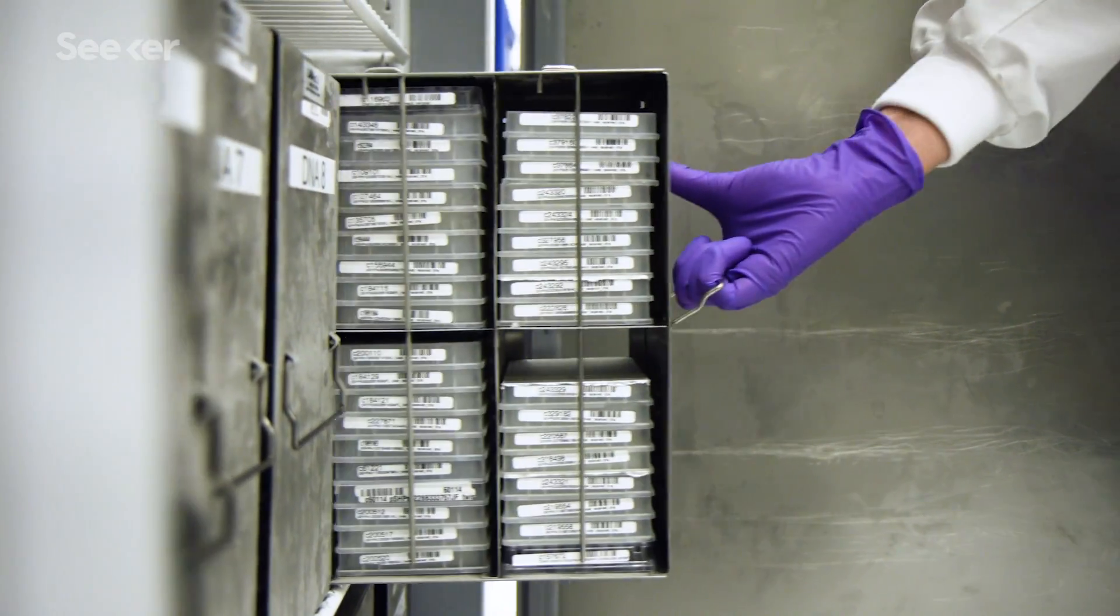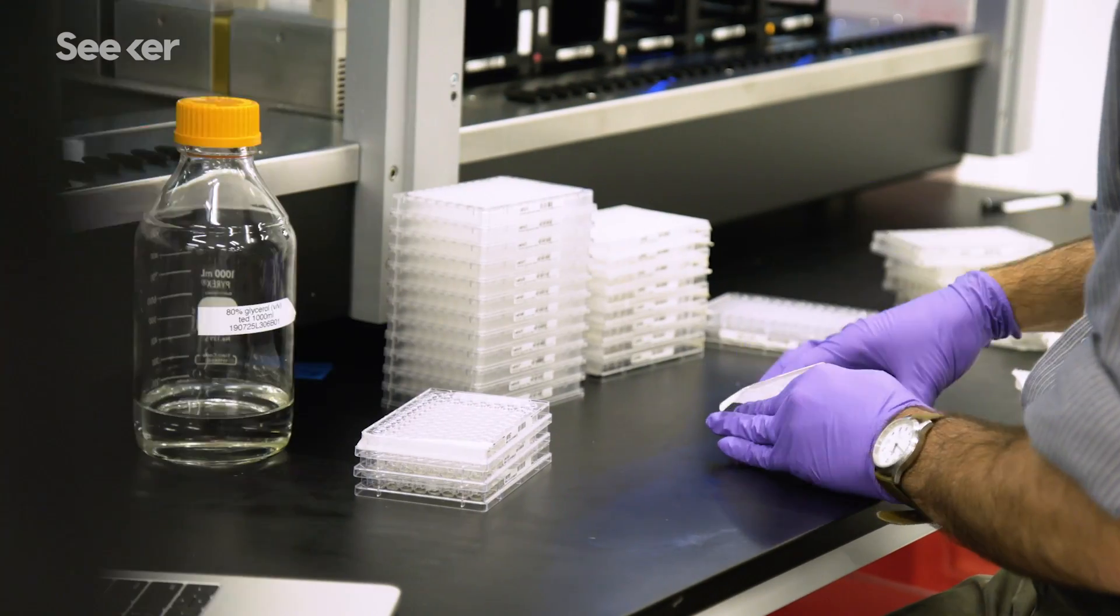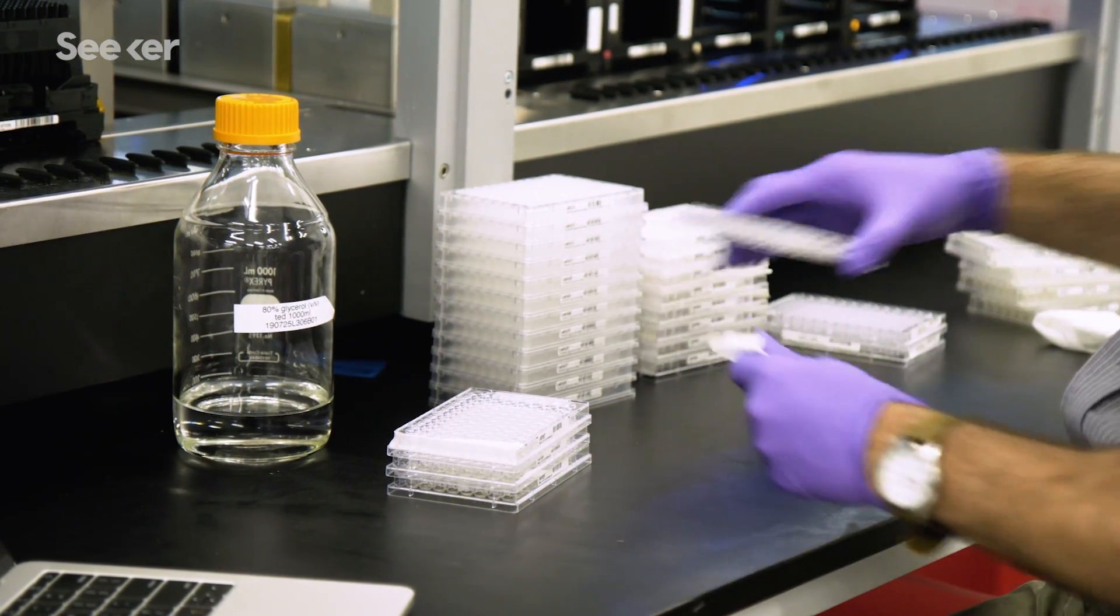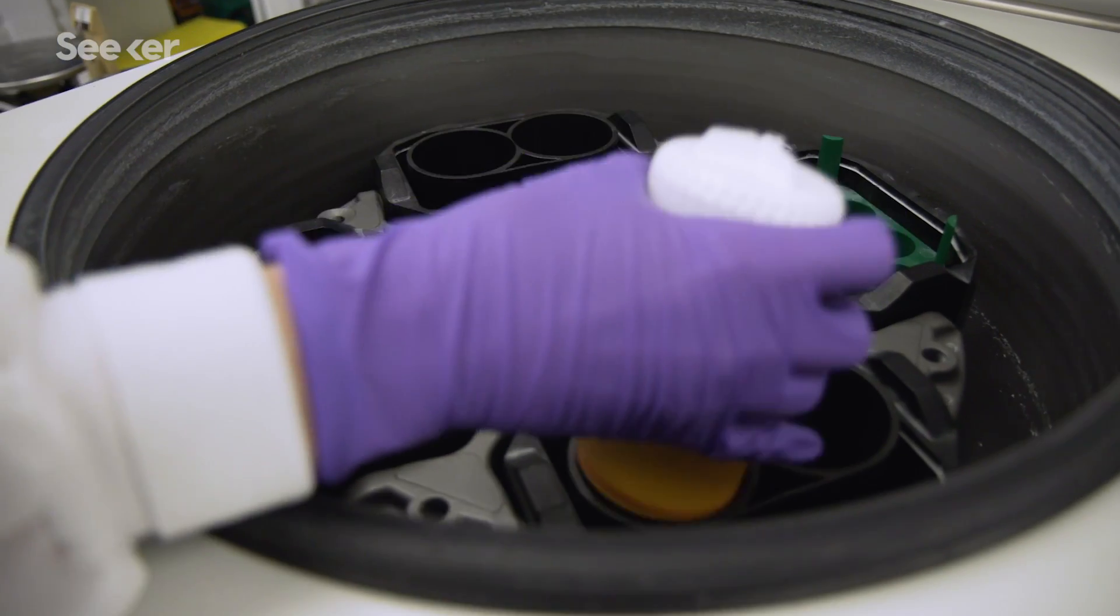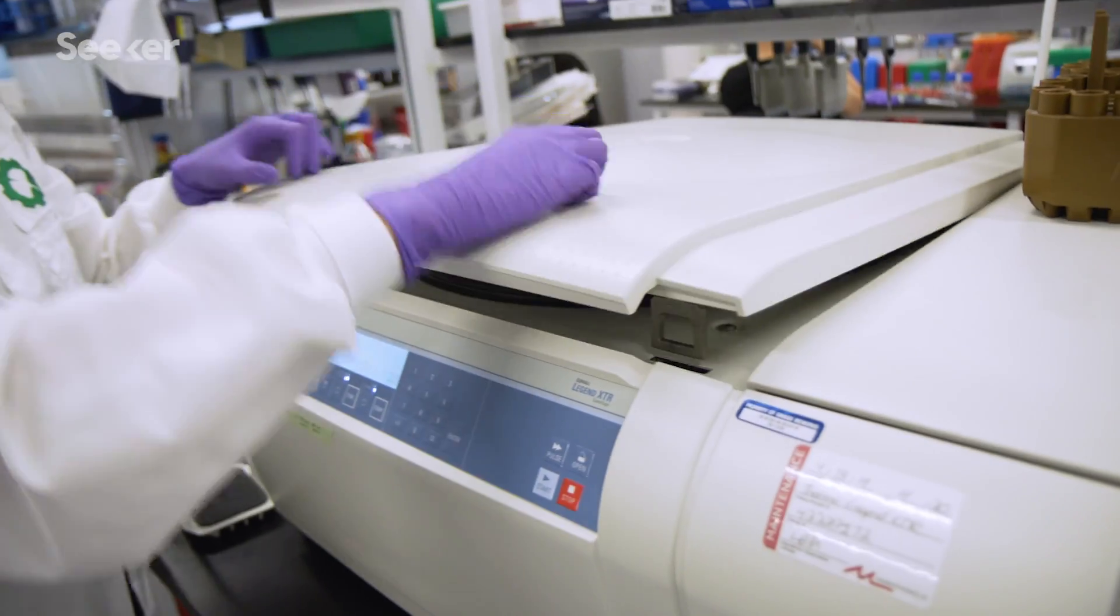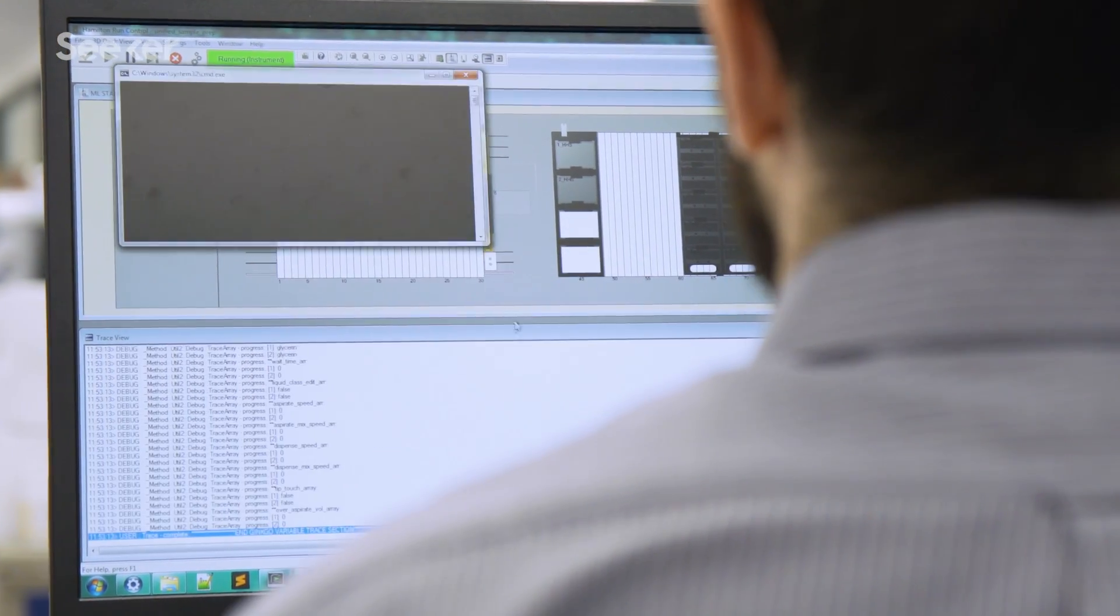Every piece of DNA ever made, every container, every reagent—everything has a barcode. For every strain we make, we generate a lot of data. All that data will be put into our database that has been designed by our software engineers. Right now, a rough order of magnitude, I think we're doing millions of operations per month.